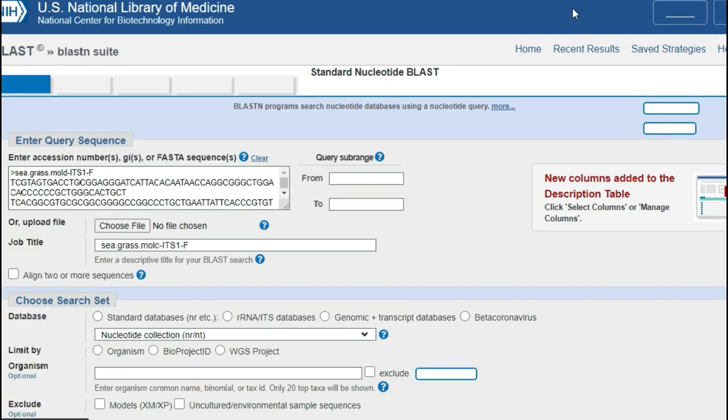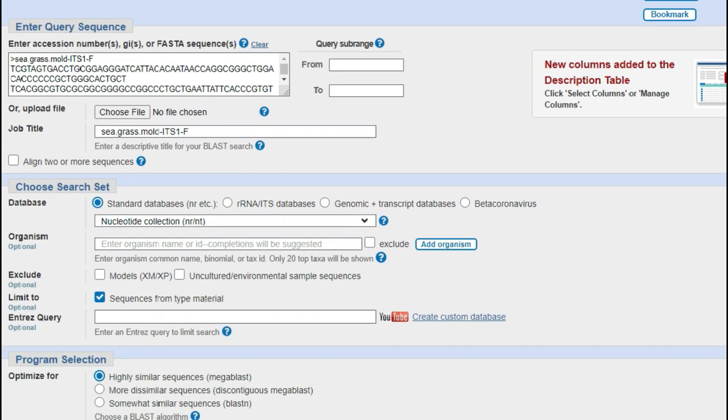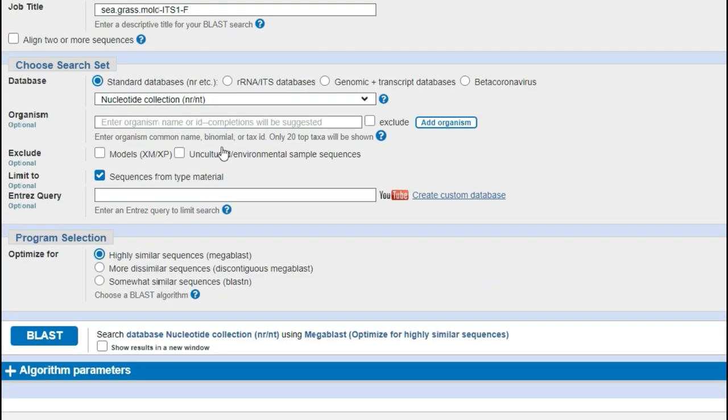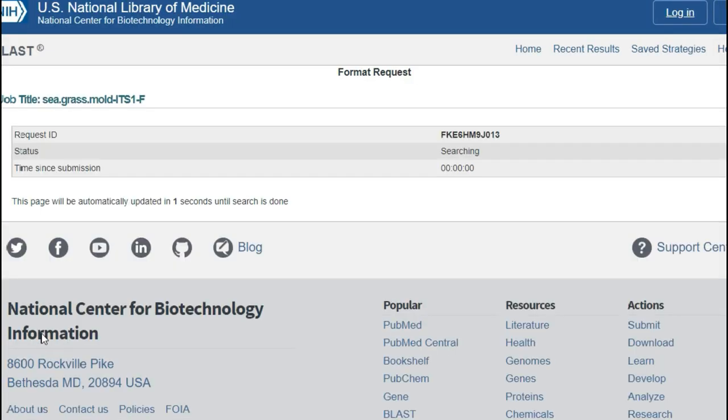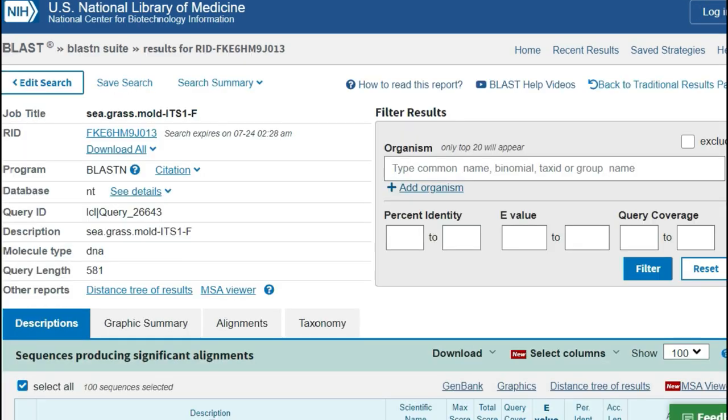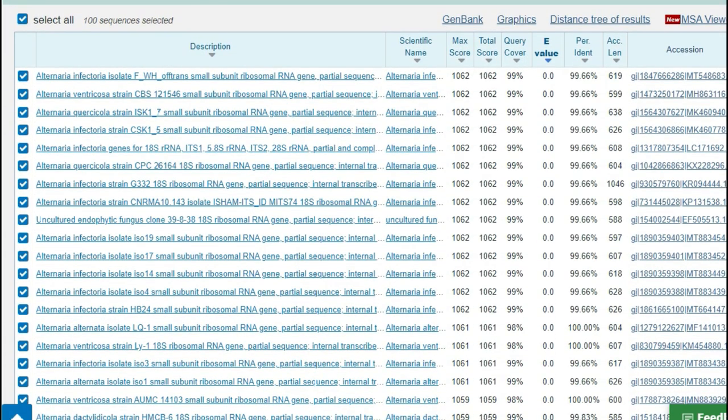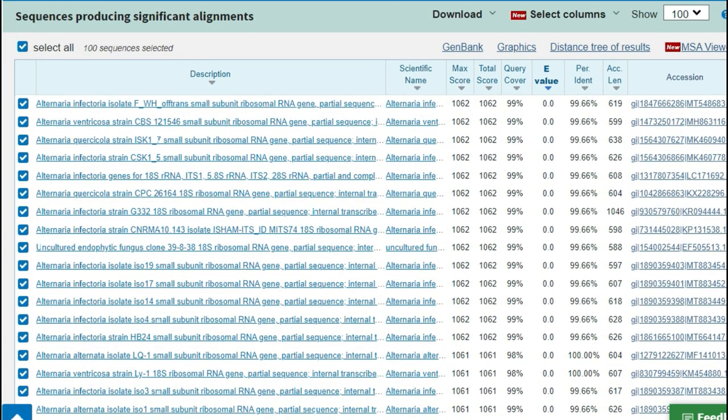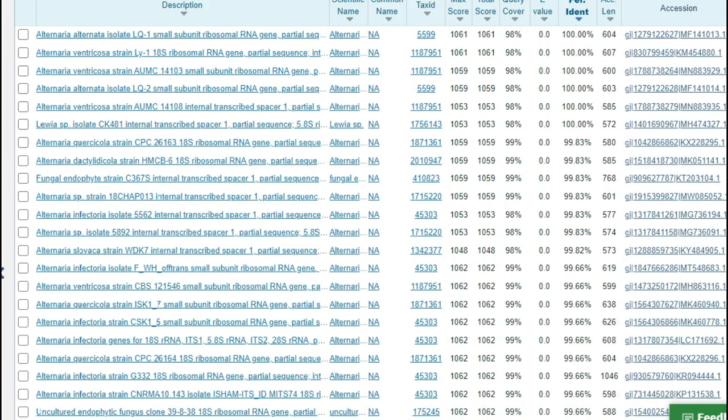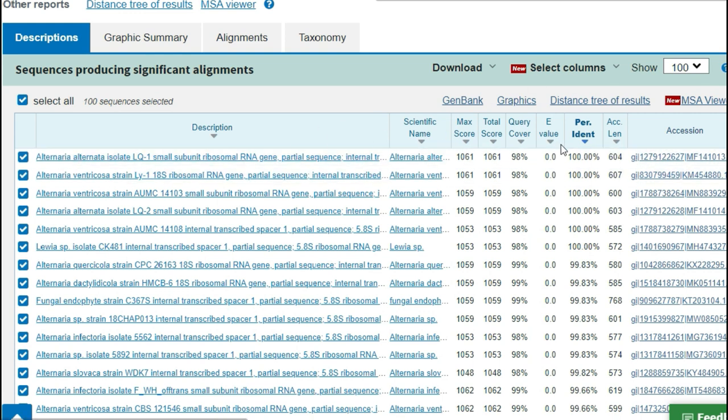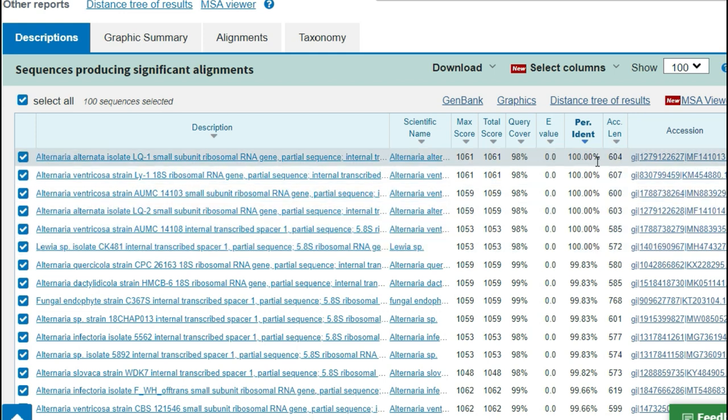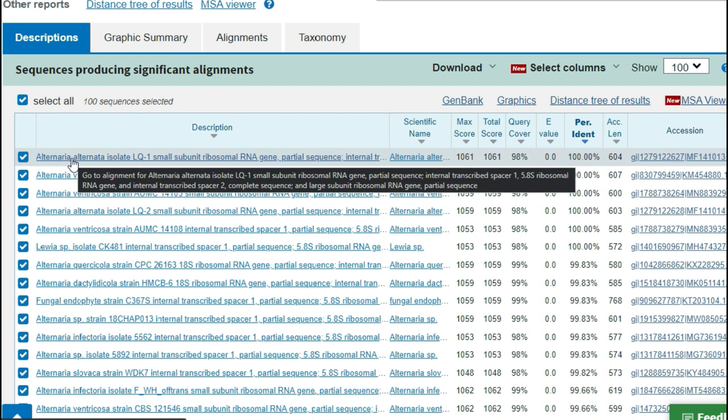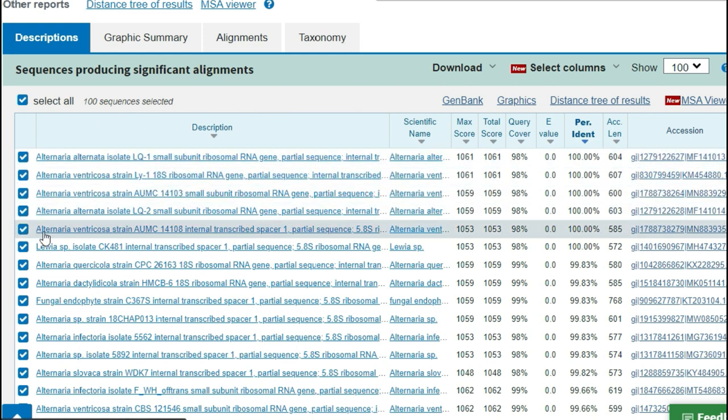And so after making all of the annotations using type material I like to re-blast the updated sequence with the type material search turned off so that we can now look at all of the other sequences and see how our sequence compares against all of the sequences in GenBank.